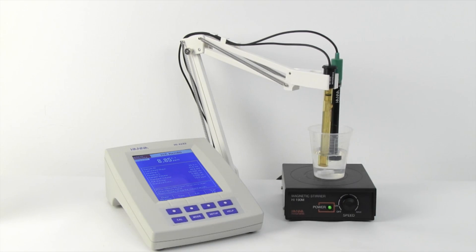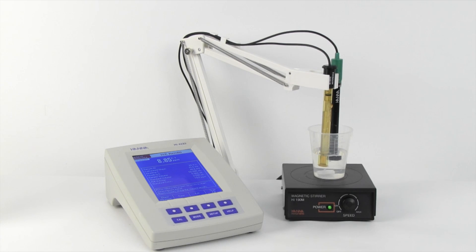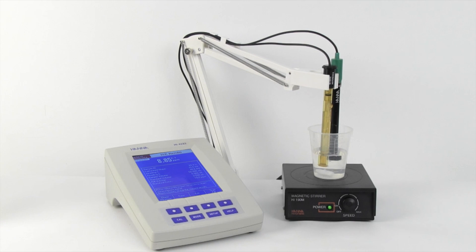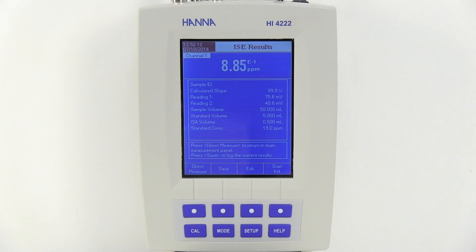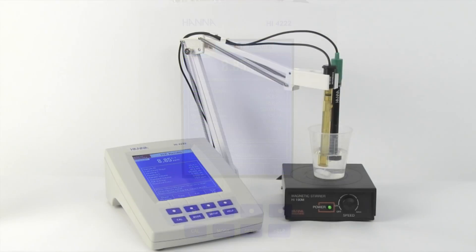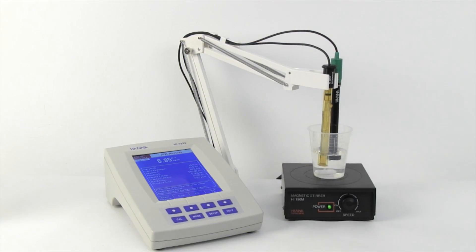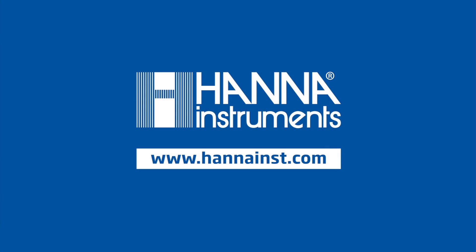This is how to perform an incremental method for fluoride determination with the HI4010 fluoride ISE, HI5315 reference electrode, and HI4222 meter. If you have any additional questions, please contact your local HANNA office at www.hannainst.com.